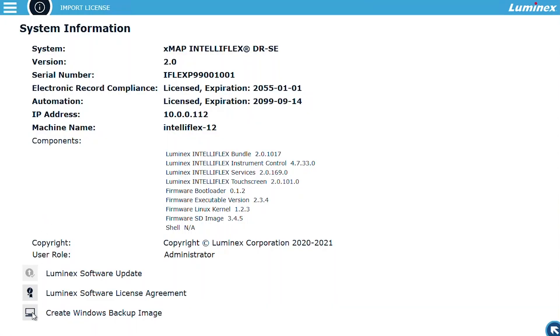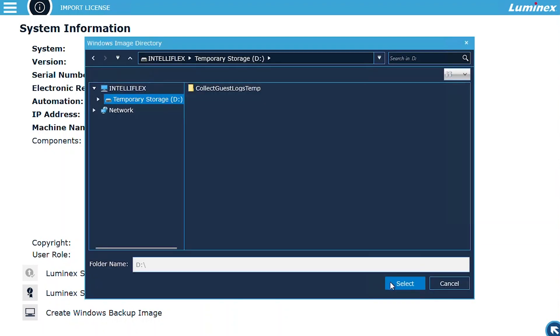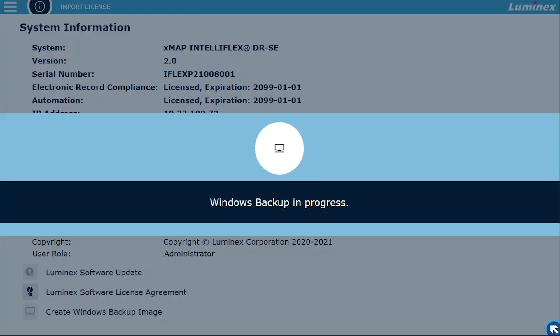Backup Restore. Lastly, starting with IntelliFlex Version 2.0, a full system backup may be initiated from both the command line and IntelliFlex user interface. All backups are full system backups, including both the operating system and IntelliFlex application data.